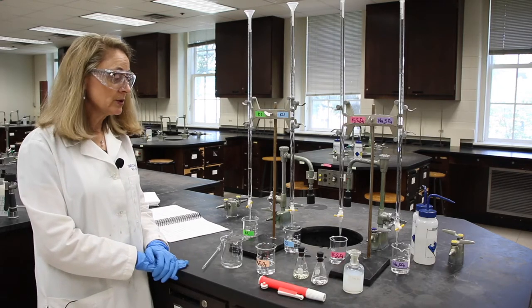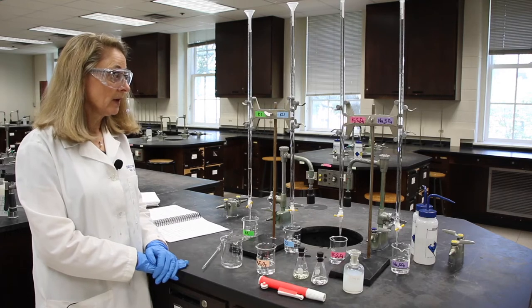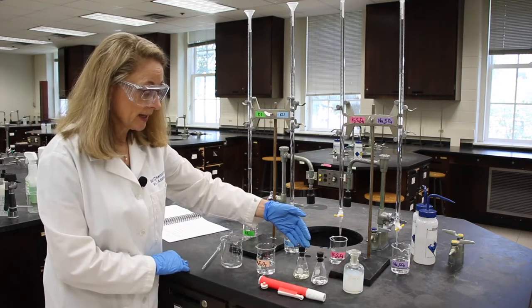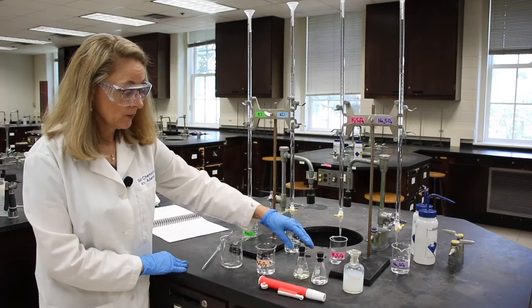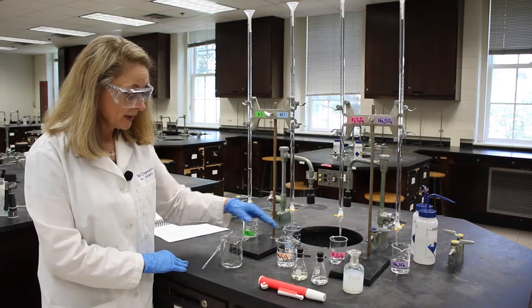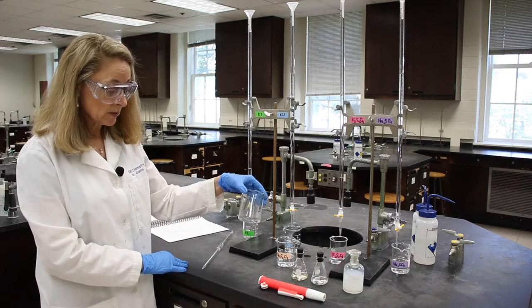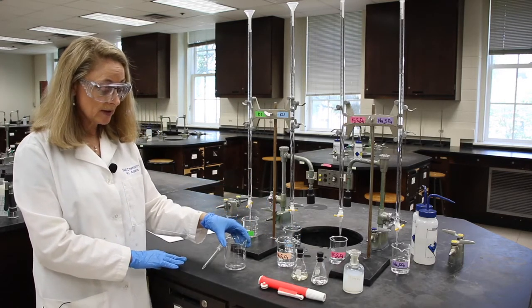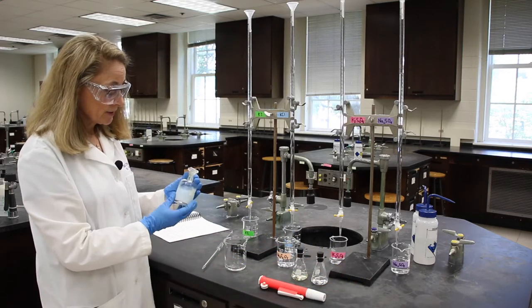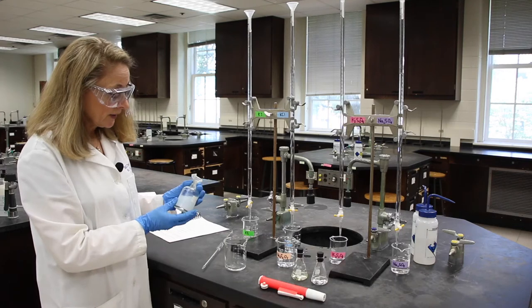In solution one, we've drained these already. There's a table in your lab manual. We've drained them to 2 Erlenmeyer flasks. And I've already pipetted 10.0 milliliters of the sodium thiosulfate to the beaker. I'm going to add some starch. That is going to be our indicator.